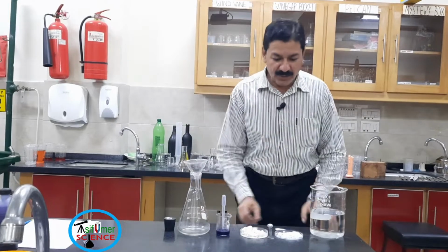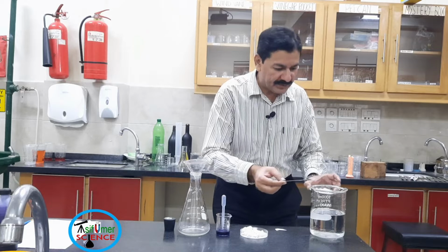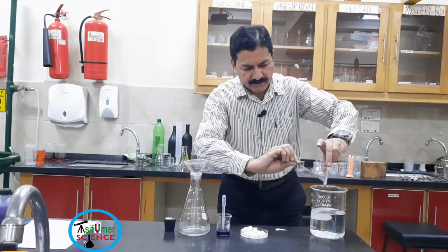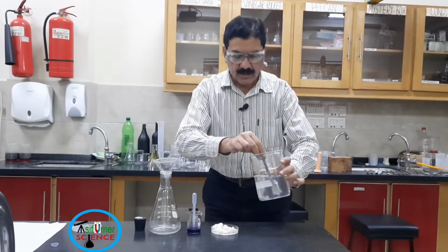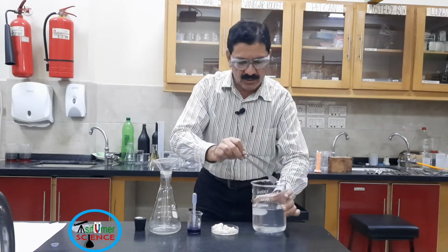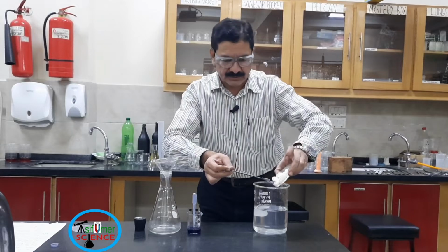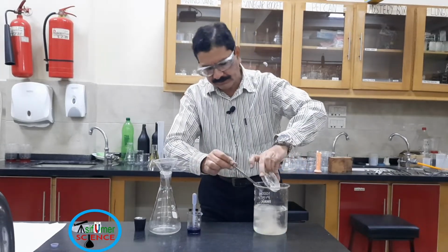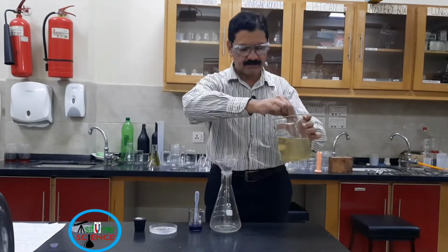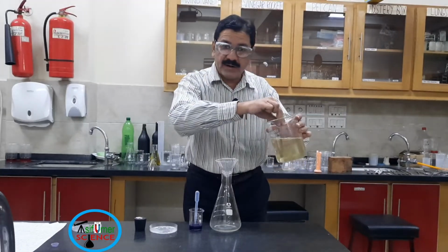First step is I am going to add potassium hydroxide in 600 ml of water. Potassium hydroxide completely dissolved in water. Now I am going to add glucose in the solution. Potassium hydroxide and glucose dissolved in water.